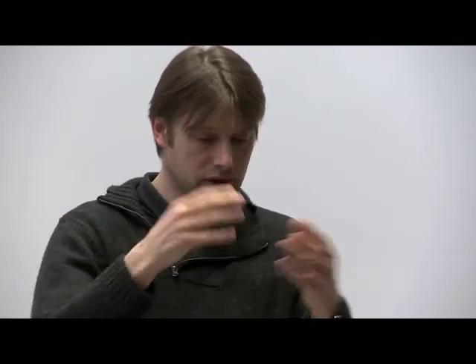Have you heard of freezing purified protein by dropping it directly into liquid nitrogen, as opposed to putting it into a tube? Yeah, that's certainly a possibility. Wouldn't it affect the protein too much? No, not at all. We actually have done it a little bit. We were shipping samples to Berkeley, and that was the way that we froze our protein: drops in liquid nitrogen, small spherical balls.